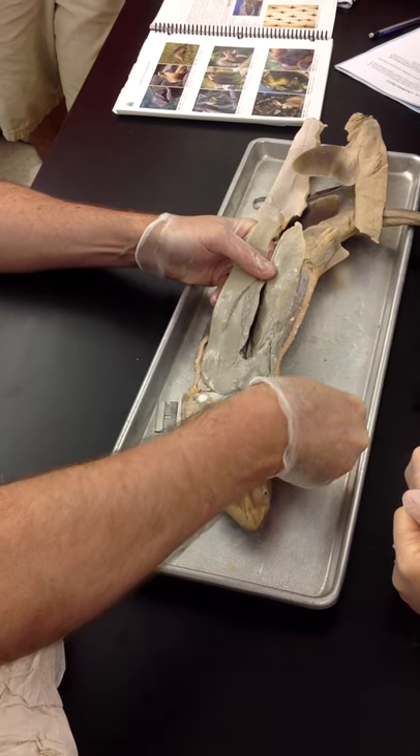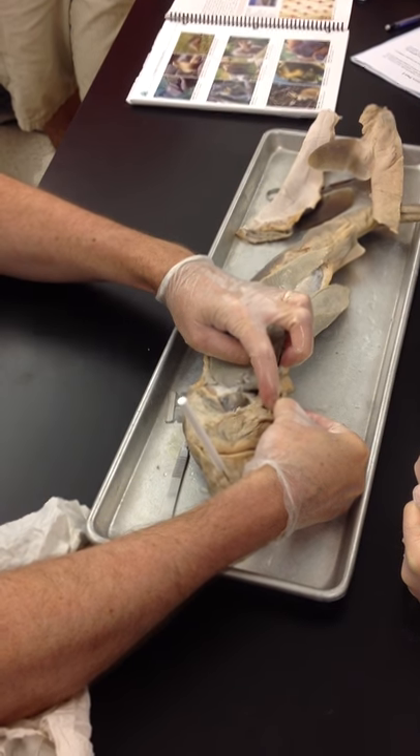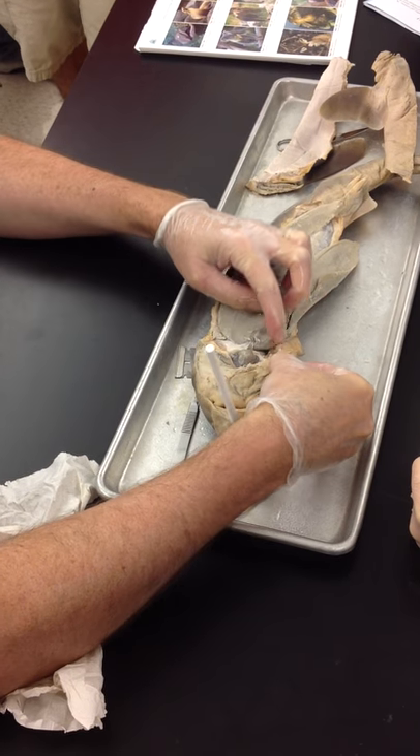Up in here, all this gray, fluffy material — those are the actual gills themselves. All of this here, those are the actual gills doing the gas exchange.